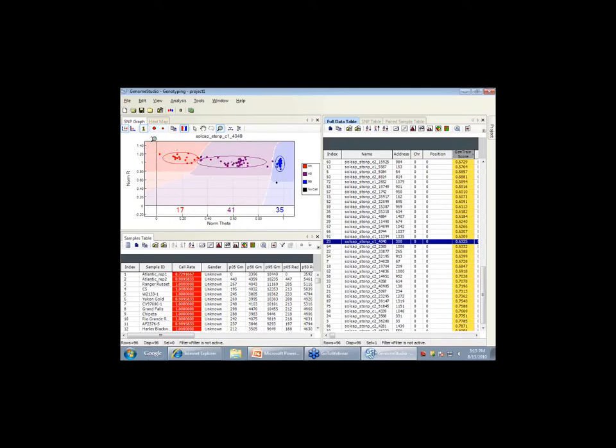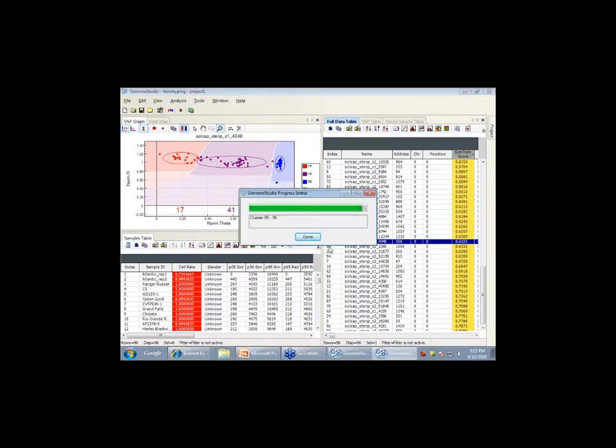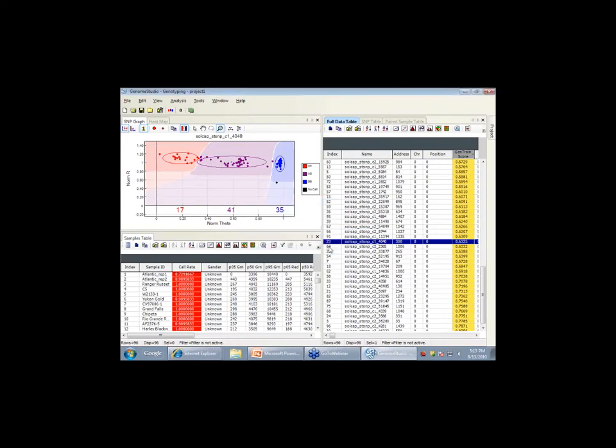That's the first part. If you want to auto-cluster all the SNPs, this little guy here, when we started our project, if you forgot to click auto-cluster the SNPs, we can just hit that. Right now, if I auto-cluster all the SNPs, all the movements I made before won't be saved. So I hit yes, and it goes through and calculates the statistics again. You can do that at any time.